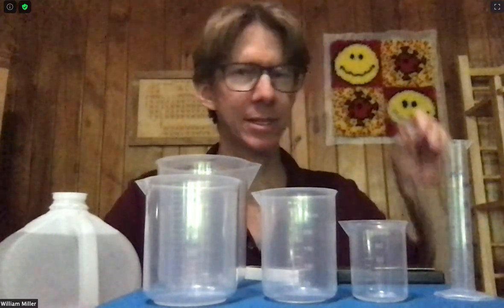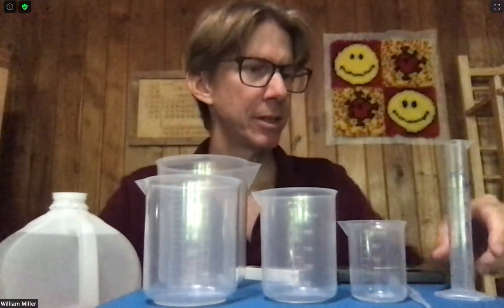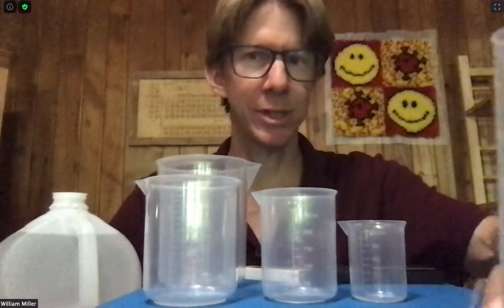These are the materials for Experiment 1 basic techniques. You'll need a plastic pipette, a 3 milliliter plastic pipette, and you'll need a 25 milliliter graduated cylinder.